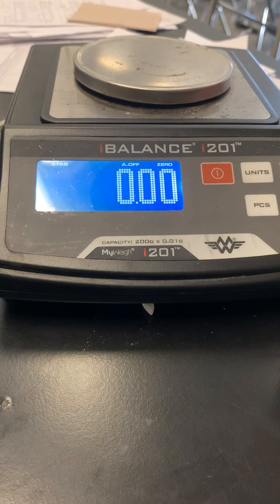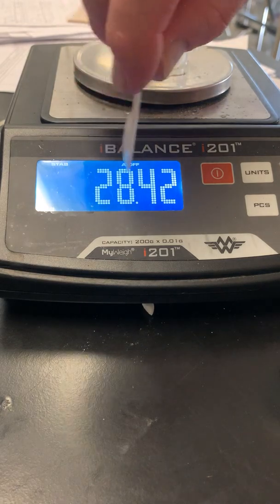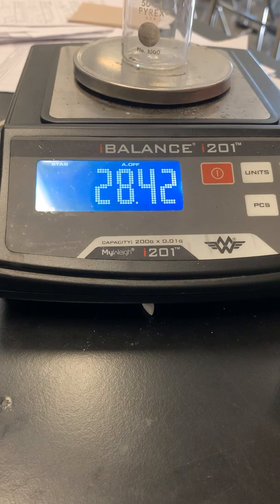This is the lab titled Lab Stoichiometry of a Reaction, Calculating Moles and Grams. I might have called it the Aluminum and Copper Chloride Lab, which is common. So this is a lab where we start with a beaker and we add 1 to 2 grams. So this is at 28.4. So I need to add a little bit more to that.